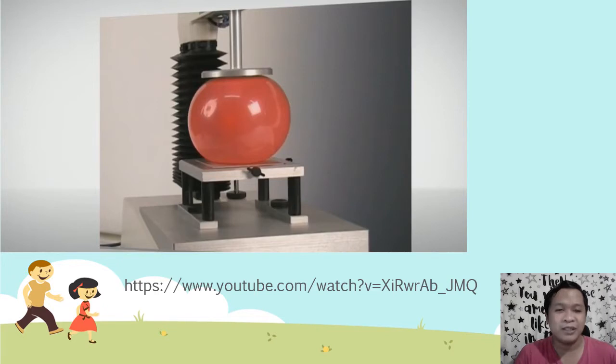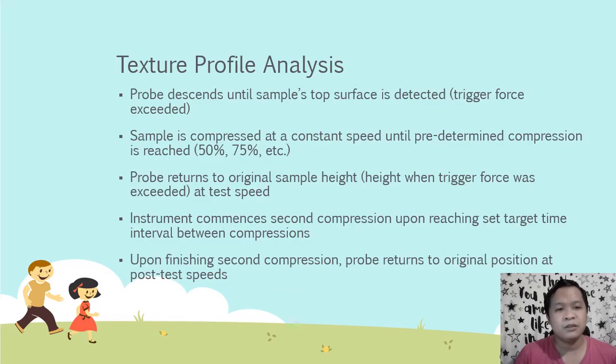And there's also one in the OST which I used for my thesis, again for a fee. Pero sila nag-operate. So when it comes to analyzing the texture of solid and semi-solid samples, or sometimes very viscous liquids, we do use the most common, which is the TPA, or texture profile analysis.